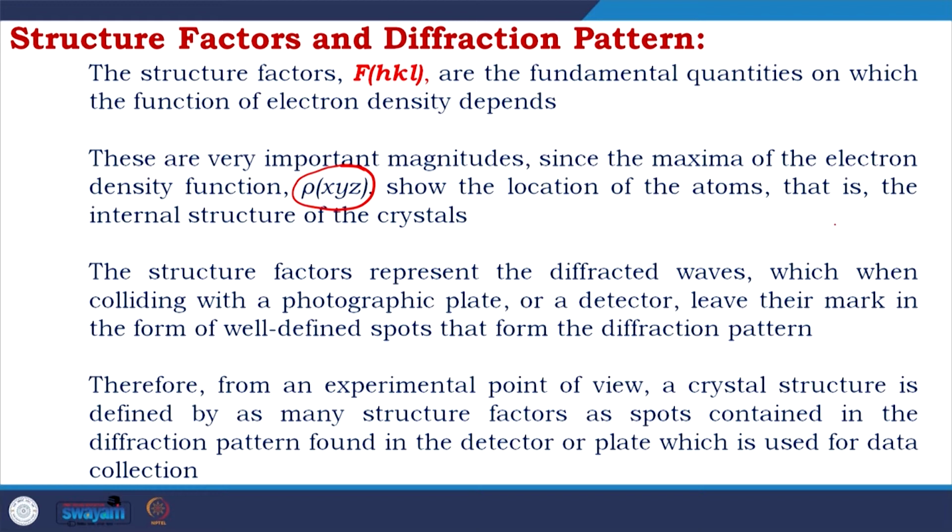So, if you have a lot of spots, all of them are representing atomic structure factors, and together they are presenting the structure factor.